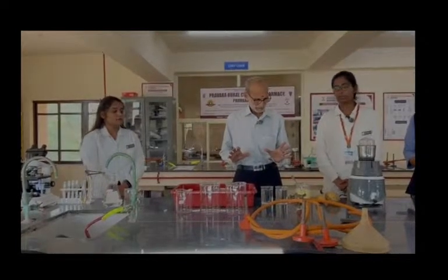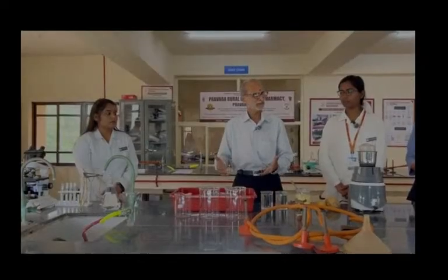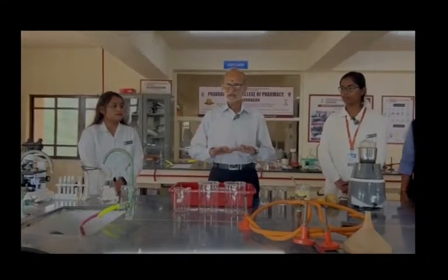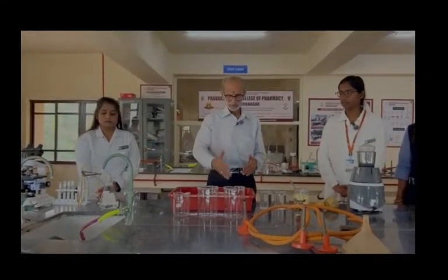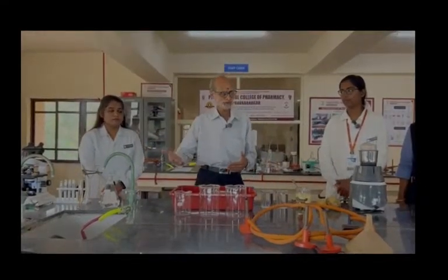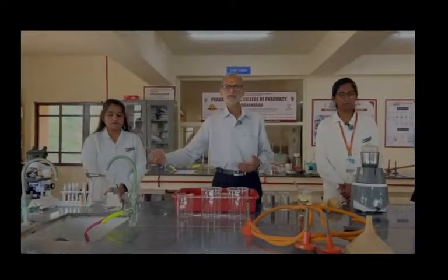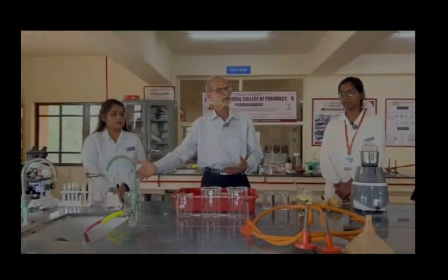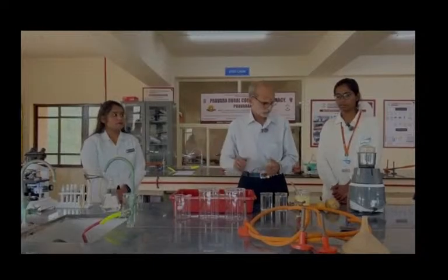So we are going to pass it through the mesh. Whatever passes through will be the starch. Then we'll pass it into the beaker. We will allow the starch to settle down, since it is heavier, and decant the supernatant. Thereafter we will give one more washing with water, and then we will dry it along with the solvent. Though commercially this particular method is not used, for demonstration purposes we are going to use methanol for the drying, to remove the remaining water.